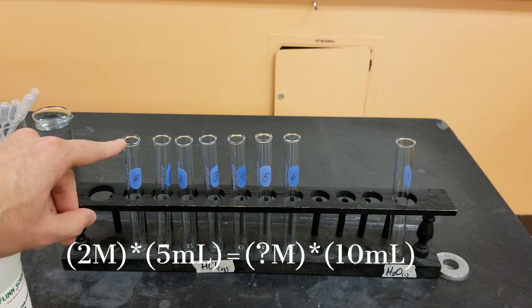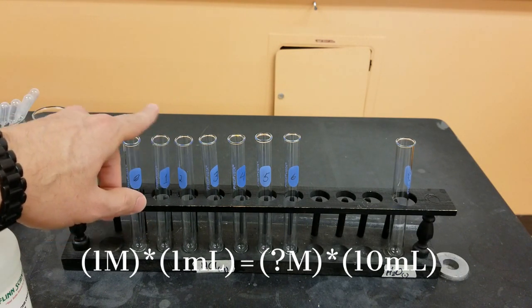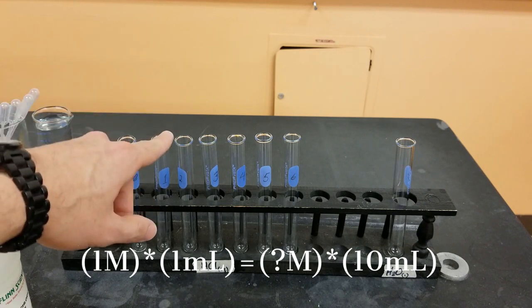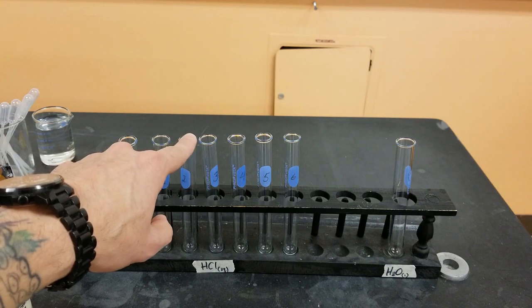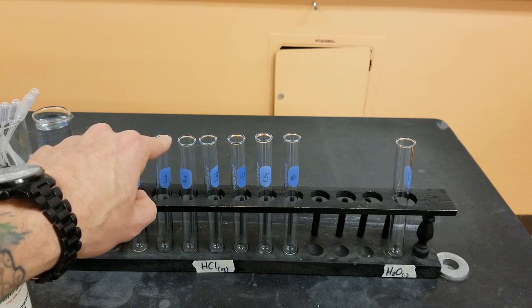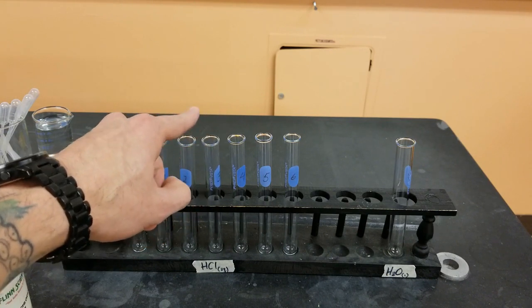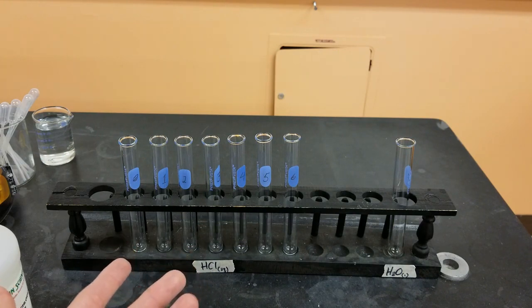For solution number one, I'm going to be taking nine milliliters of water and one milliliter from test tube zero, mixing them together. For test tube two, I'm going to be using nine milliliters of water and one milliliter from test tube one. For test tube three, nine milliliters of water and one milliliter from test tube two, and so on. That is called a serial dilution.